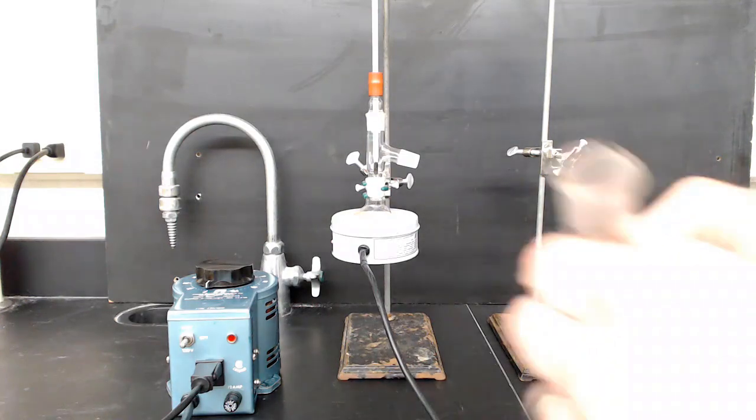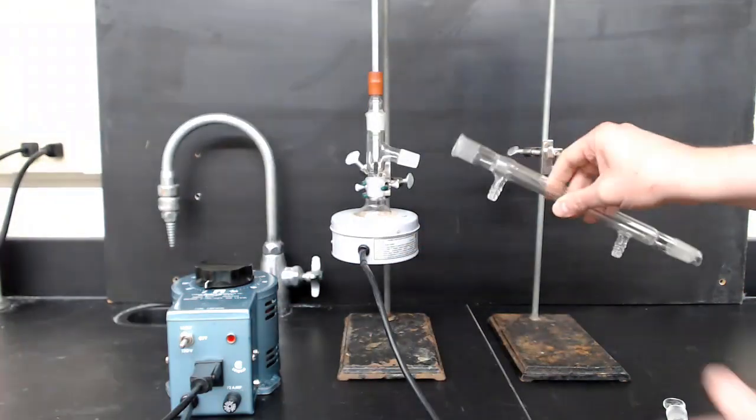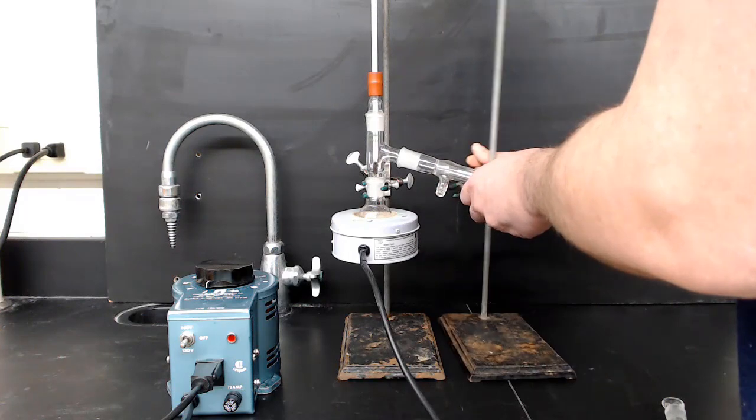Next, we're going to put on a condenser. The condenser connects to the three-way adapter and needs to be clamped to make sure it doesn't fall over. Clamp it securely.